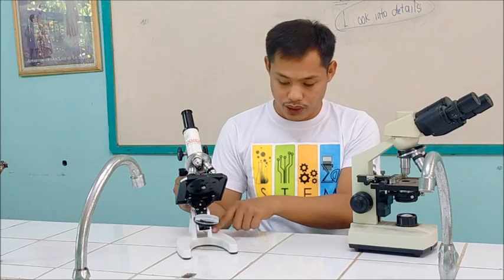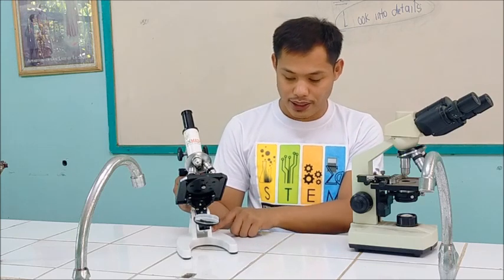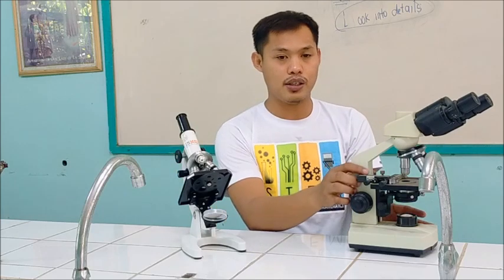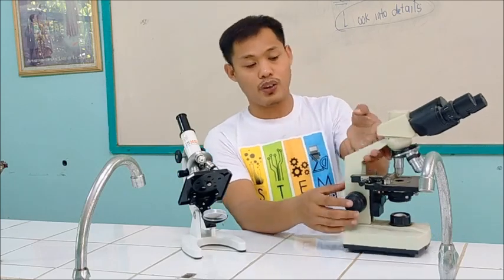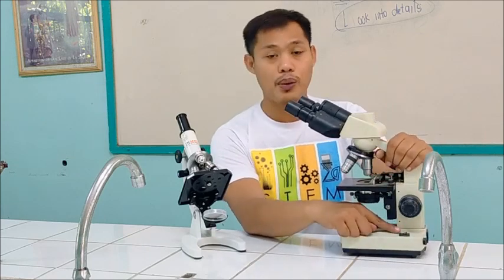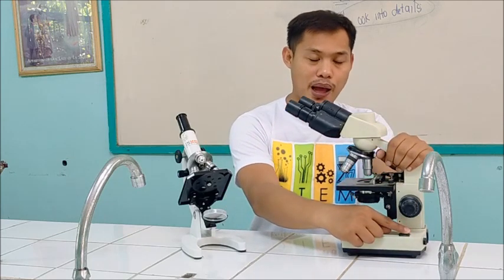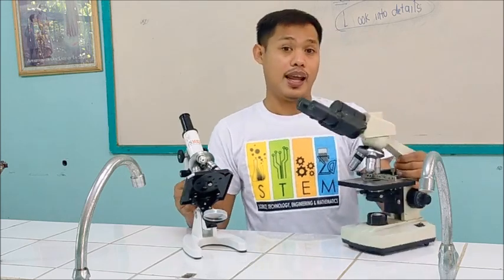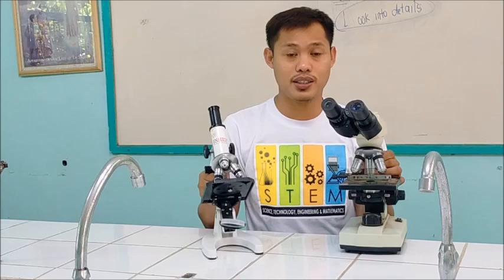We also have the base. The base holds the totality of the microscope. For our binocular microscope, we also have the power switch, power off and on. And that's the function and the parts of the microscope.